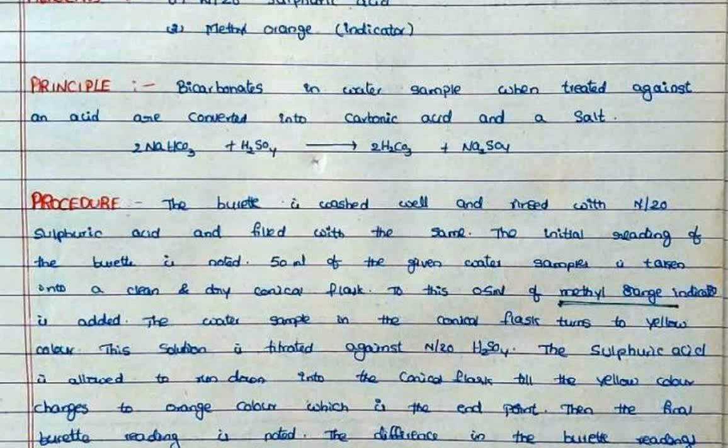The water sample in the conical flask turns yellow in color.